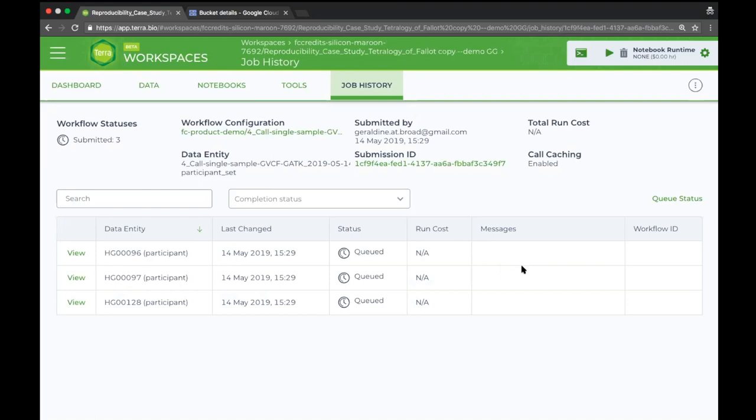At this point I can just run the analysis — launch it. Now I have three workflows running, each one the same pipeline running on the three different samples in parallel, and each one of those is parallelized for the HaplotypeCaller execution. I'm running this GATK pipeline on three exomes, and I could just as easily select a hundred or thousands of the samples and it just runs like that.